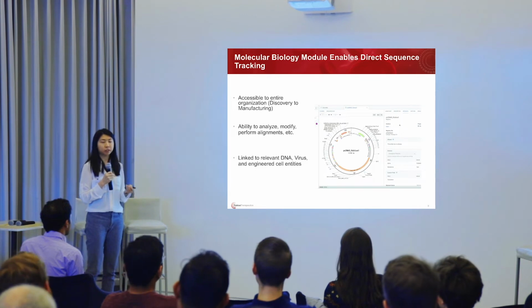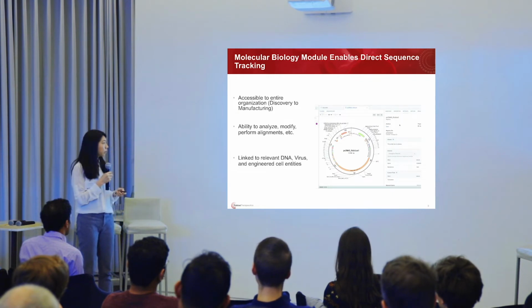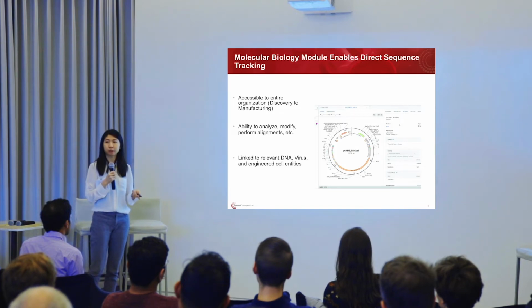We're able to analyze our sequences, modify them, and perform any sorts of alignments on them so we can validate that this is the correct sequence we've been working with. And then we can link these to all the DNA or viruses or subsequent cells we've worked with.